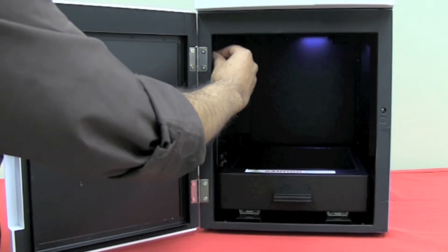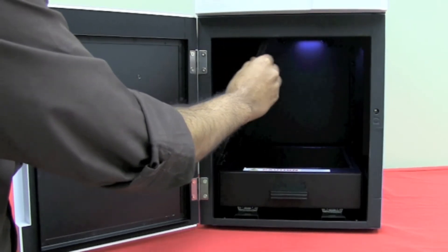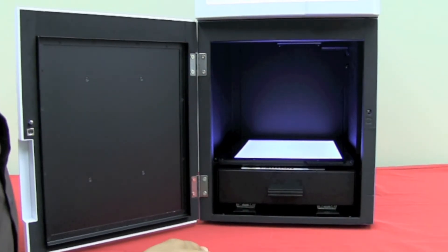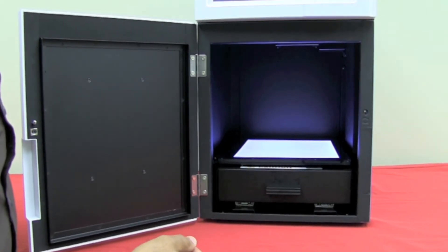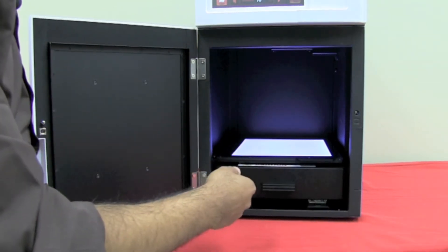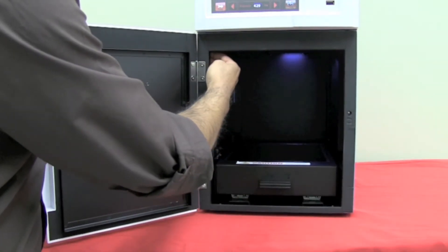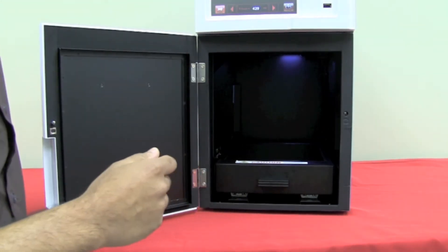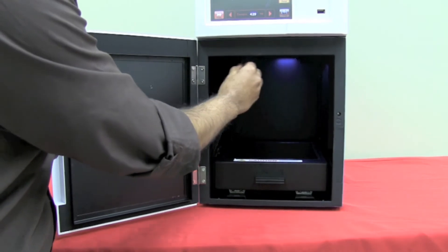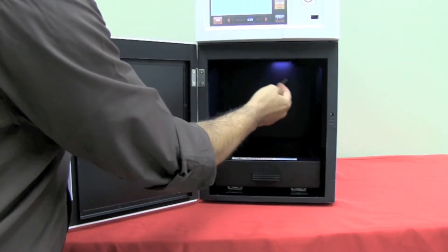The white light table is located to the left of the instrument and is mounted on hinges. You can see it turns on when I lower it like this. The white light table is designed to provide a bright surface to visualize your gels and plates during operation. When I slide it up again, you'll notice that it turns off. If I was to make a criticism here, the hinge is probably a little stiff for what it needs to be, but that's probably a lot better than it being too loose.